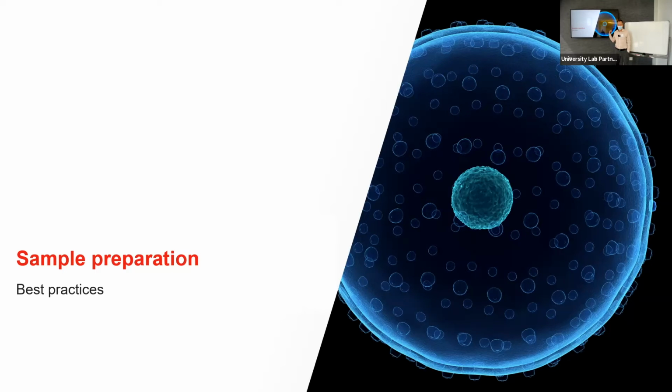Yeah, and Jen is very well equipped over there to run sorts for you. So yeah, that's great. It's a good thing to have in a core where people can come in and run it. And I suppose self-sorting, that would be self-contained.